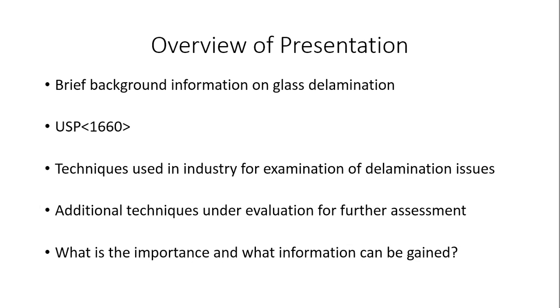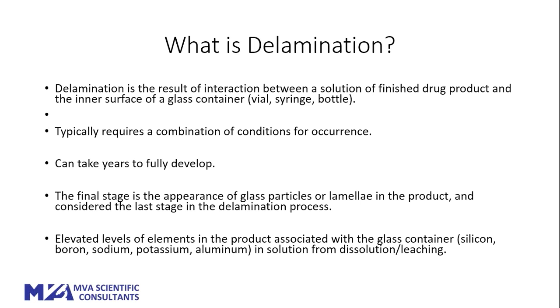We'll wrap up with what is the importance of this type of testing and what kind of information can be gained. In general, what is delamination? It's primarily the last stage in a process that is usually the first observation when glass particles are observed in a product vial or syringe. It is really the final stage — the result of interaction between the drug product and the interior surface of a container — and it often takes around five years or so to fully develop.